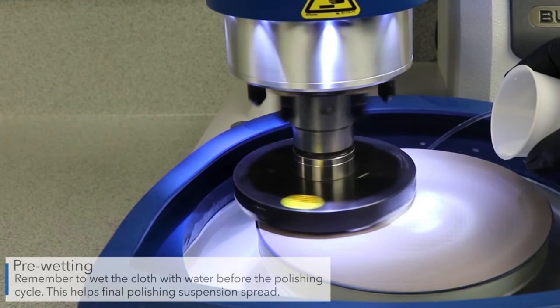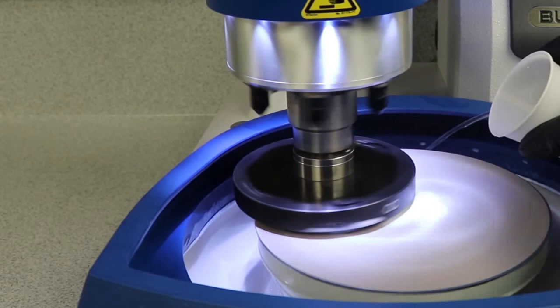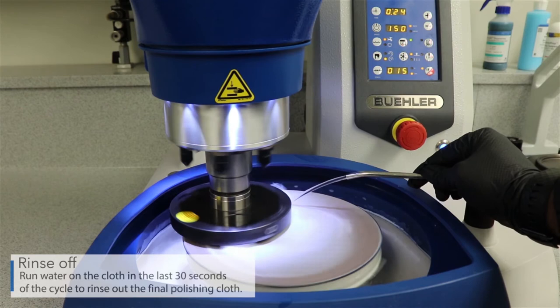During the cycle, slowly add 5 to 10 milliliters of final polishing suspension to the cloth per minute. Run water on the cloth in the last 30 seconds of the cycle to rinse out the final polishing cloth.